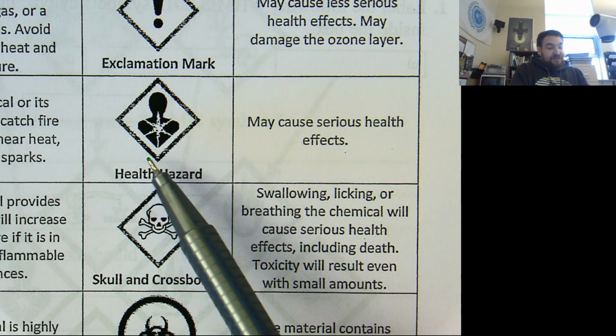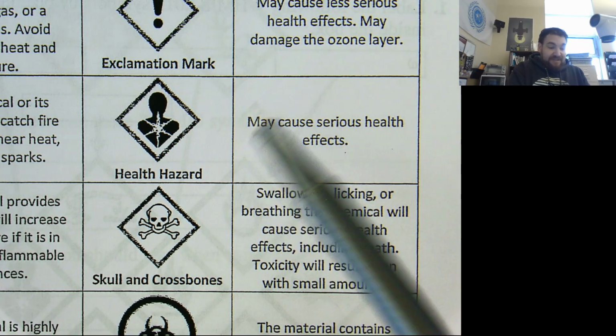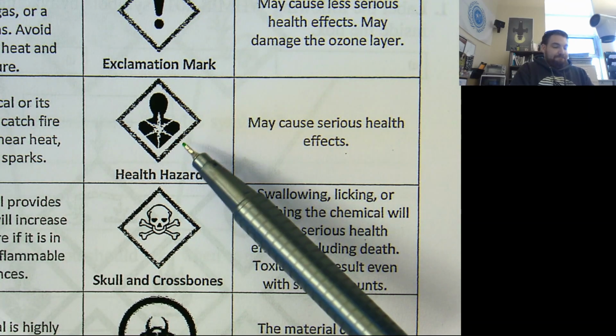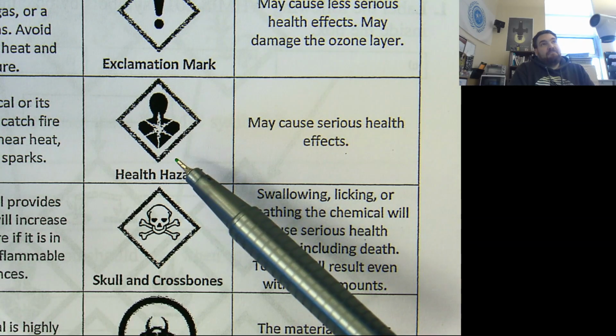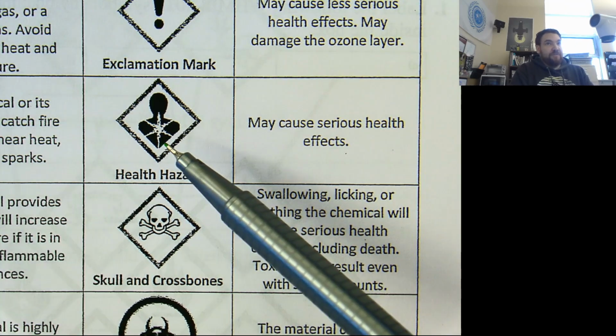This symbol is a health hazard, so this one could cause serious health effects, but serious health effects not related to corrosion. Things like asbestos would be something here, like a long-term cancer-causing chemical.